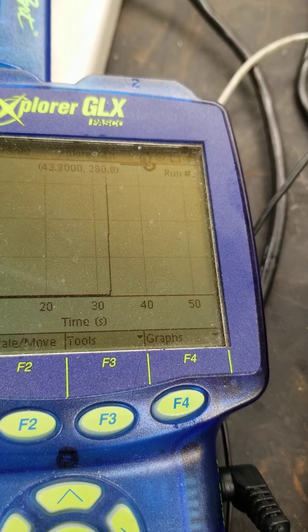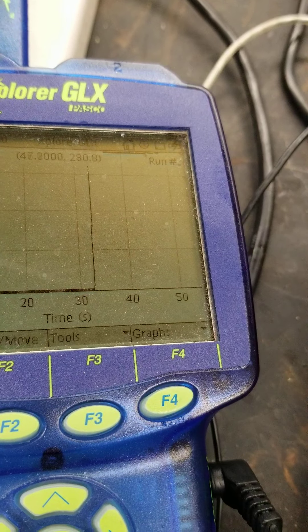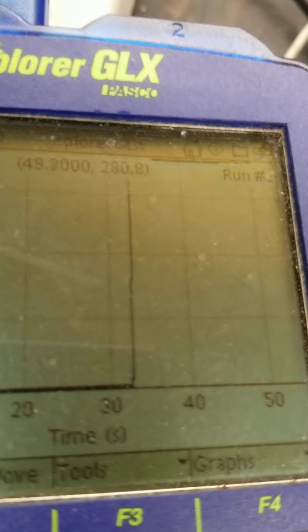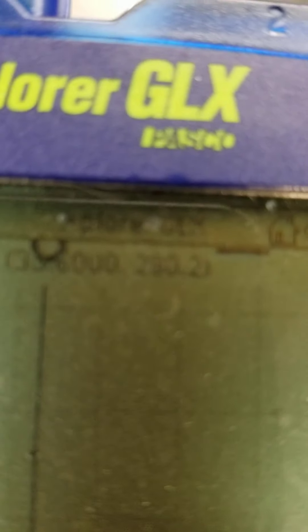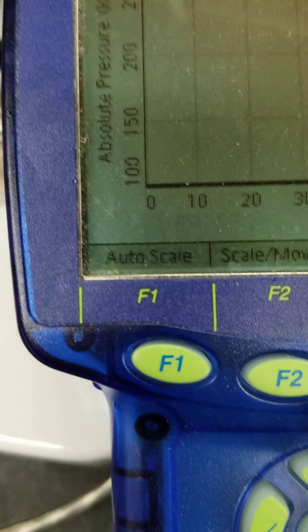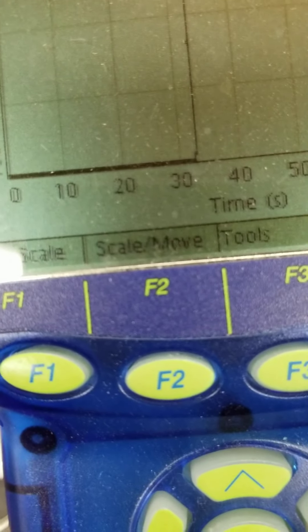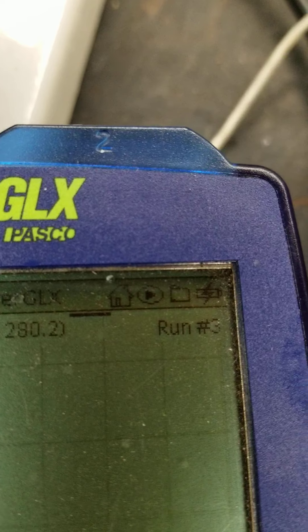As you can see, there's a steep rise in pressure, and it's kind of steady up there at the top. The reading is 280.2 kilopascals.